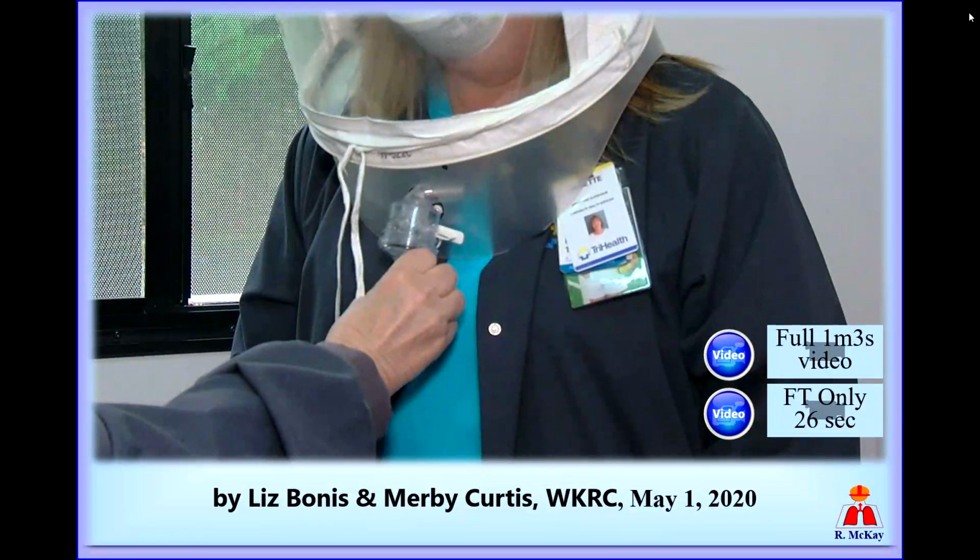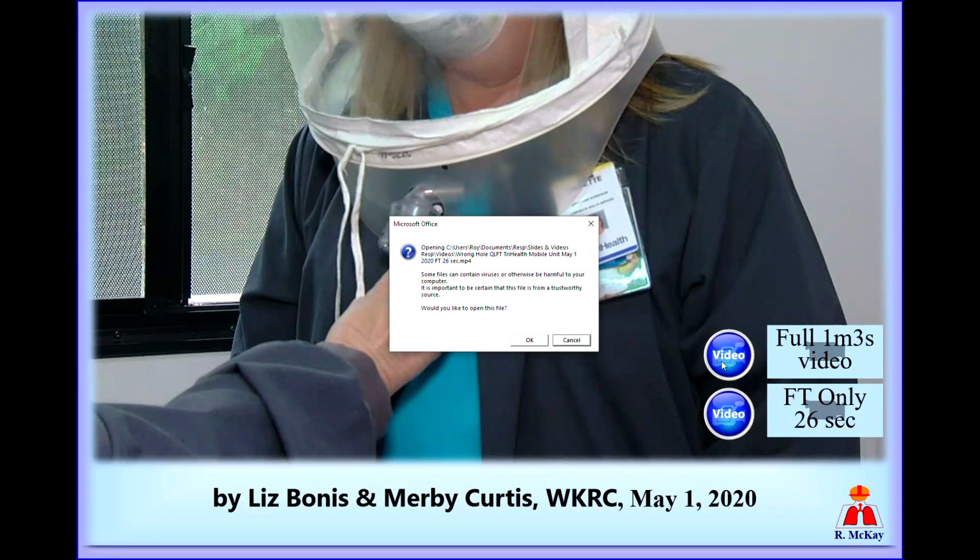Here you see another example of an operator that is spraying the aerosol into the wrong hole on the enclosure. I'll show you a quick 26-second video of this here.